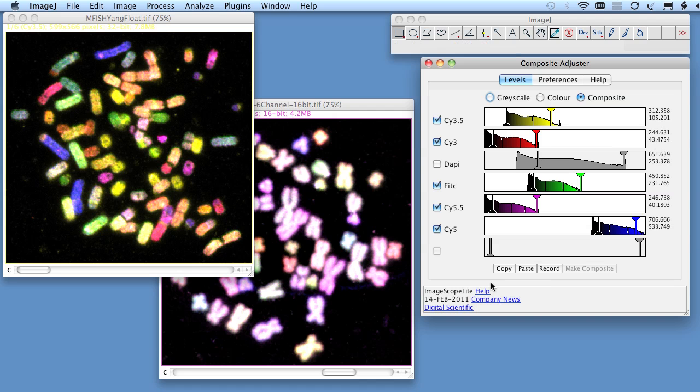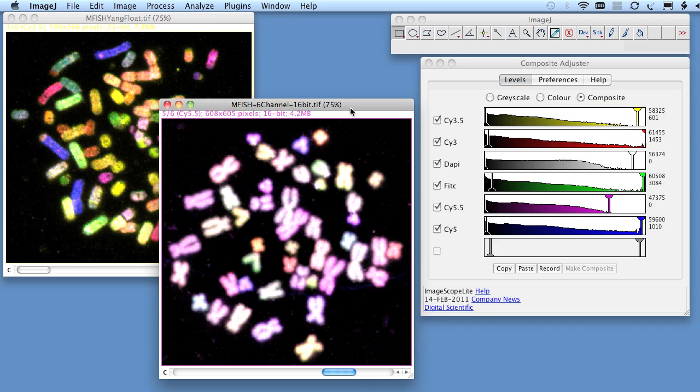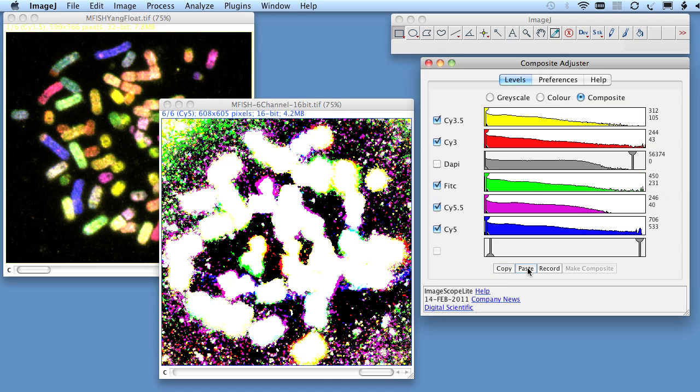and we copy these settings, and then we switch to this image, which whilst of similar content, is actually 16-bit data with a rather different data range, when we paste the settings, we get very undesirable results.